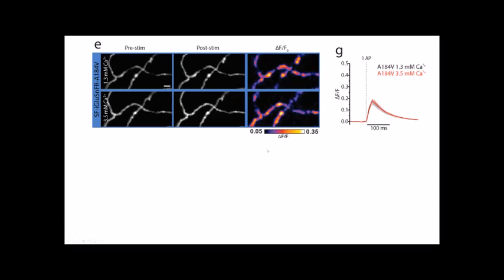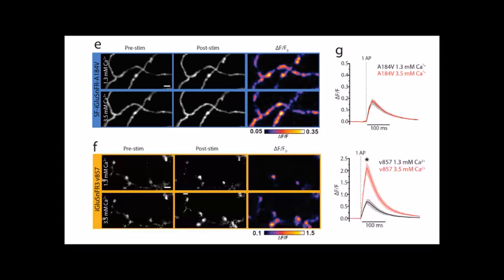Michael's lab is interested in the mechanisms of synaptic release, and it's really well known that increasing extracellular calcium dramatically increases the number of vesicles that are simultaneously released during an action potential. But when he did that while imaging iGluSnFR, he got this result, right? There's no increase, which is quite damning evidence of saturation, because we expect that the amount of glutamate released with this change in conditions is roughly threefold increased.